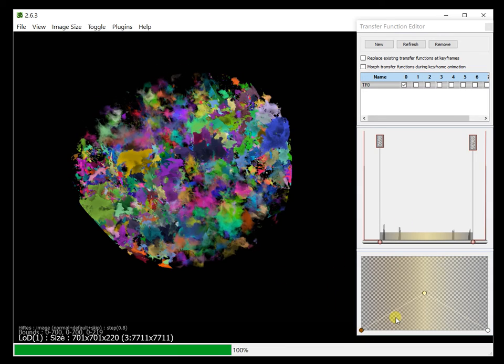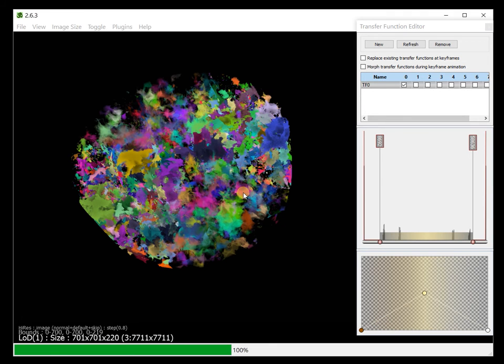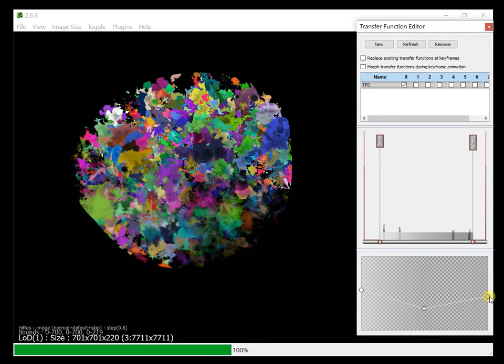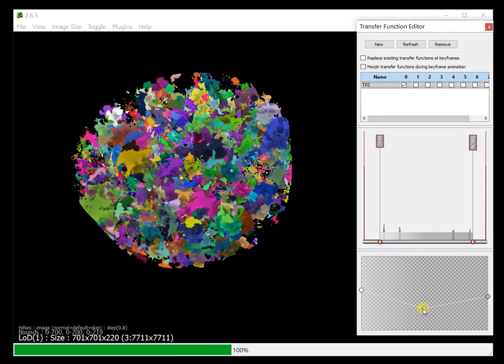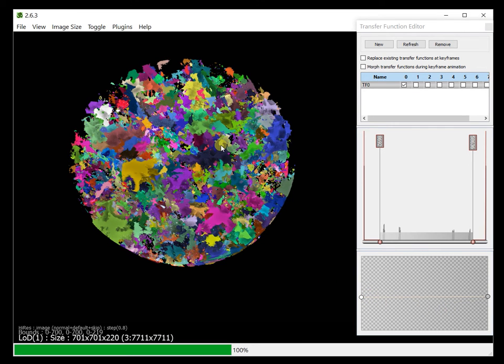Let's change the transformation to, say, white and just change the opacity so that we can get nice contrast here.